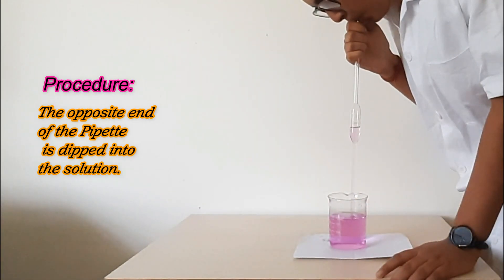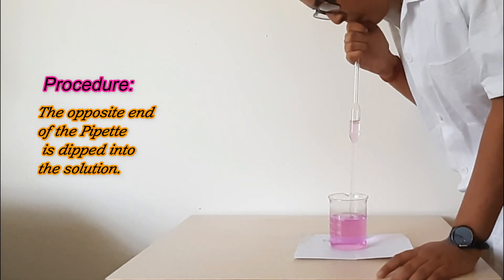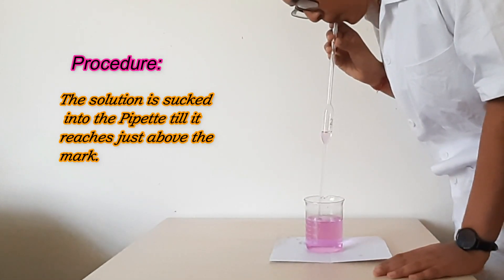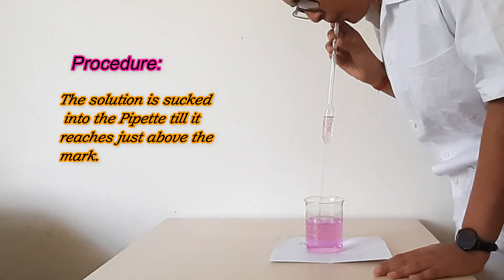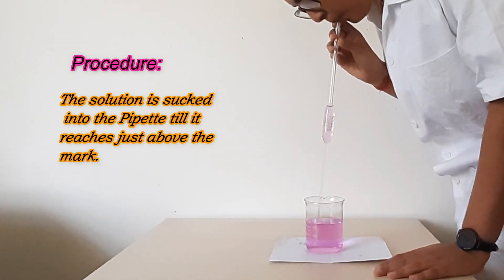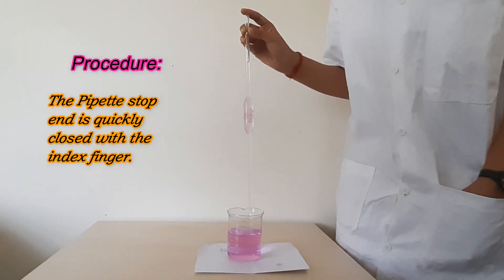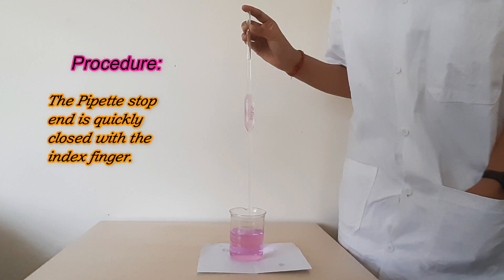The opposite end of the pipette is dipped into the solution. The solution is sucked into the pipette till it reaches just above the mark. The pipette is stopped and quickly closed with the index finger.